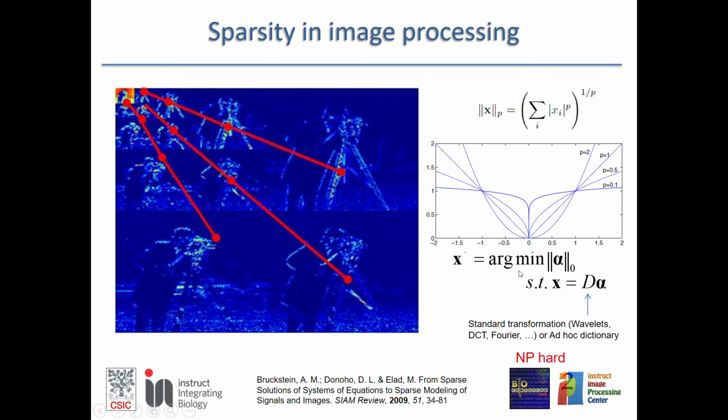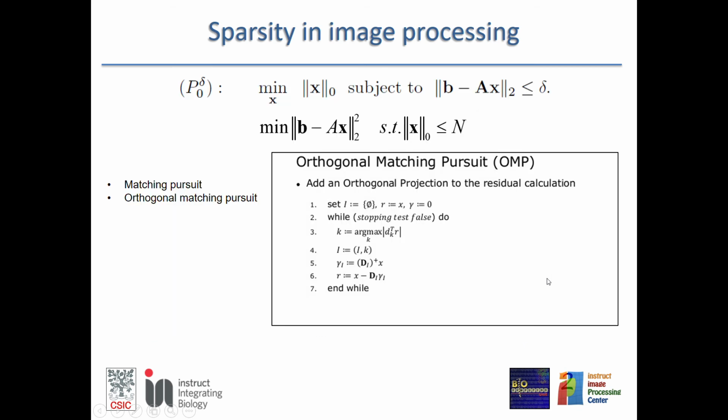That means that this zero norm is just a count, the count of coefficients different from zero. You're looking for a volume such that the count of coefficients different from zero is minimum, and that you are still able to fully reconstruct your image. And then you may work with a dual problem.